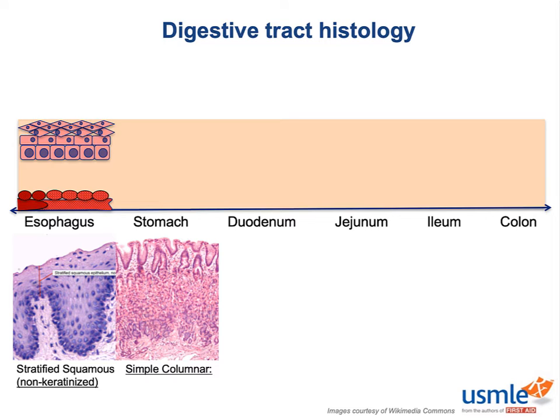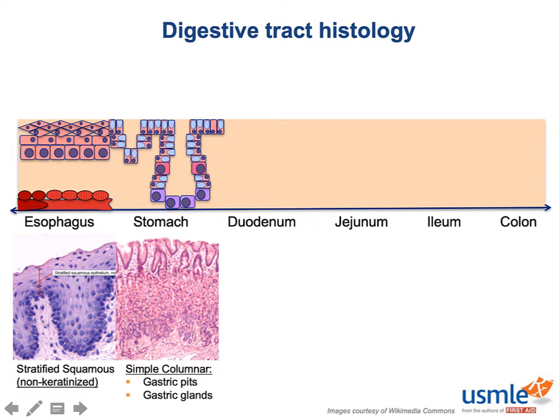To distinguish the gastric mucosa, first of all, it has a number of gastric pits which increase the surface area for mucus production. But these are pretty superficial and nondescript when compared to the gastric glands, which are identified primarily by the basophilic cells down on the bottom. These are the chief cells, and they're responsible for secreting pepsinogen, the protein-chomping enzyme that gets activated only once it's released into the gastric lumen. Now these glands are pretty bulbous on the bottom and can be irregular, so don't be too surprised if you can't see a gland all the way from top to bottom, but rather just as a couple of basophilic cross-sections.